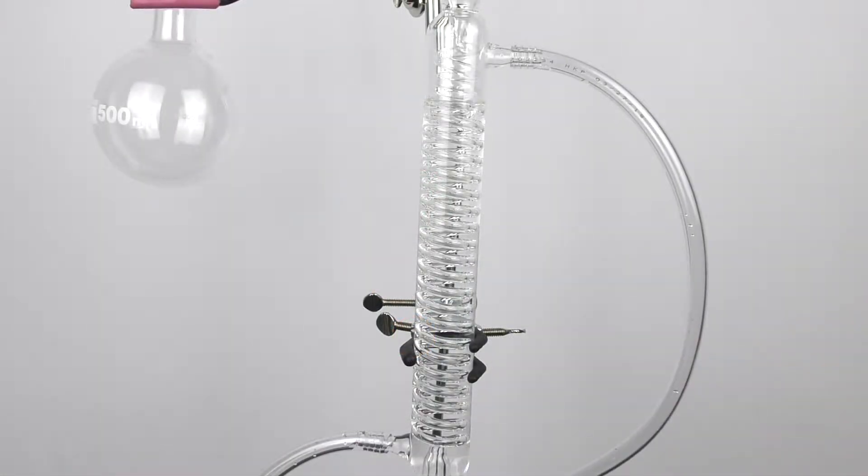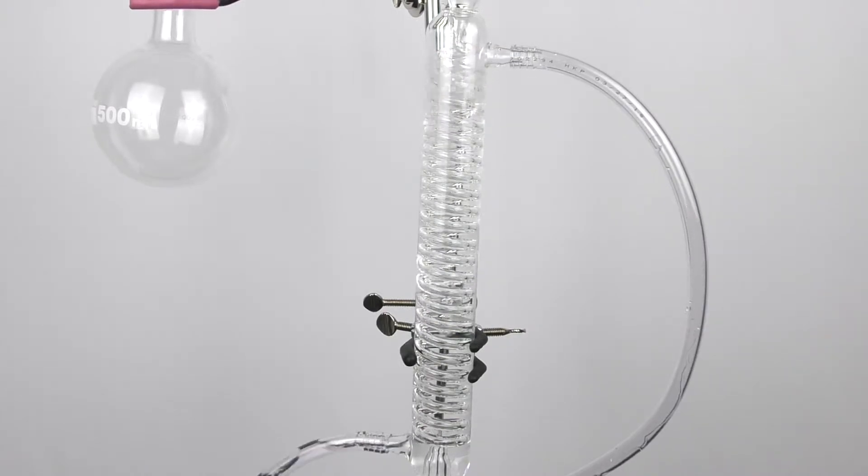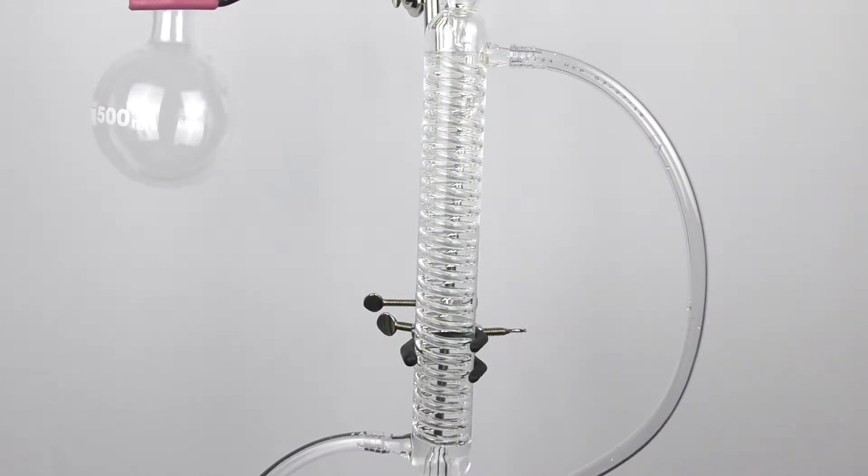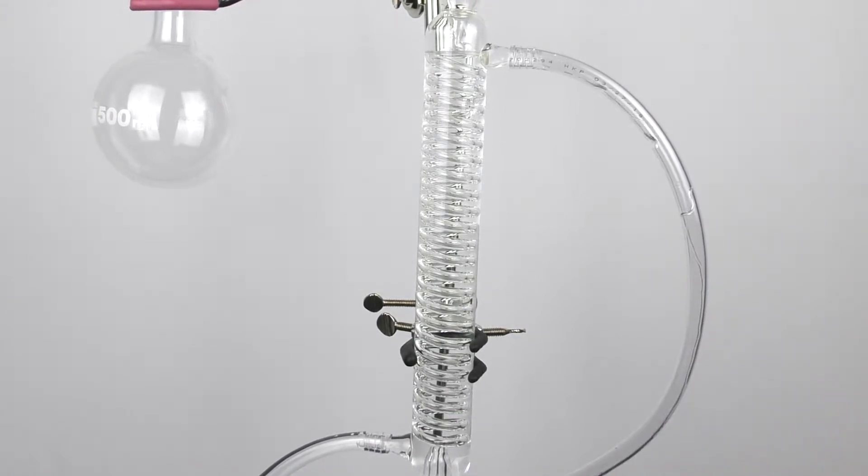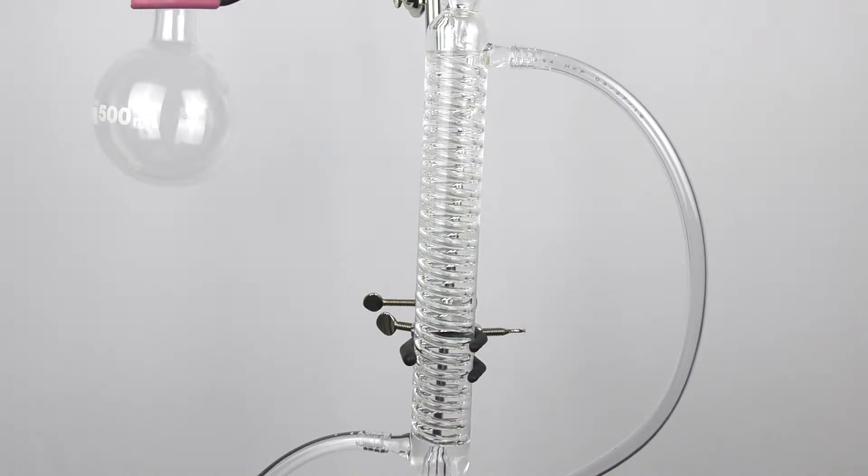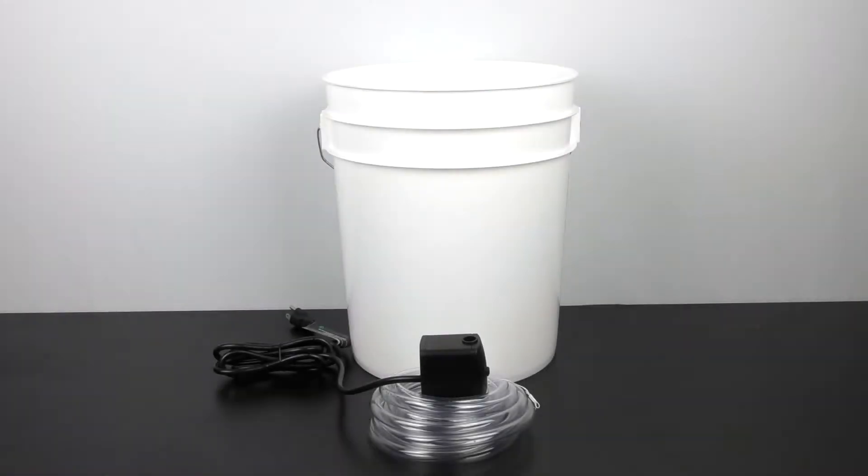For a cooling system you have a variety of choices. You can simply use flowing tap water out of the cold water faucet in your lab to go through the condenser. You can get an expensive chiller unit or you can use a simple bucket with a pond pump, some ice water, and some tubing.